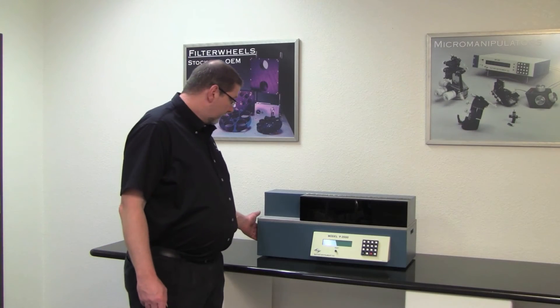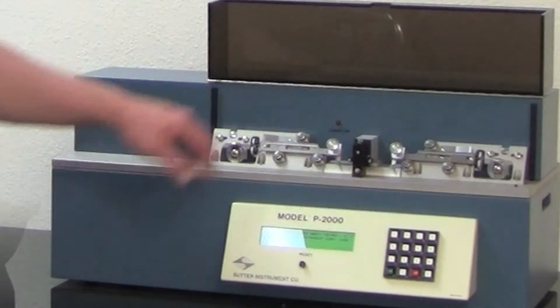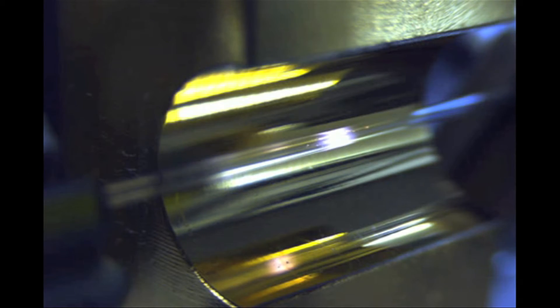Let's take a look at the instrument. Under the tinted lid, the two puller bars hold and position the glass capillary. The shroud between the puller bars encloses the retromirror, which redirects and focuses the laser beam to achieve even heating of the glass capillary.